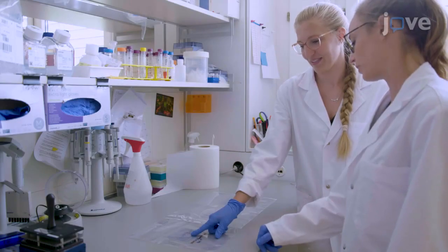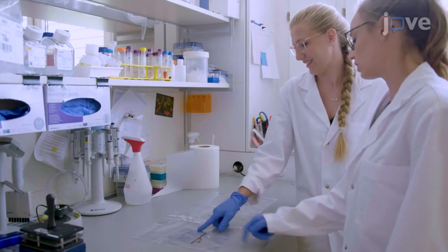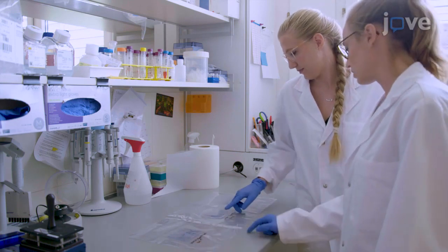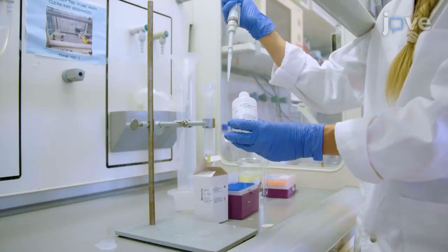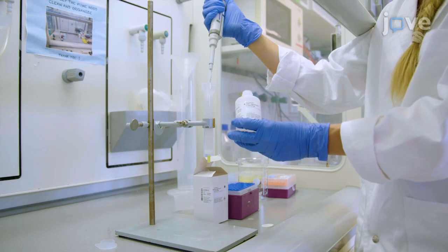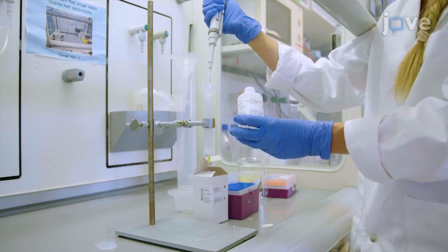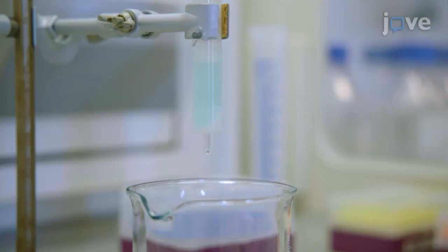Before you start, ensure that all strains overexpress their respective protein well. To begin, prepare the column for the one-pot protein purification as described in the text manuscript, using 2 mL of sepharose resin and then charge the column with nickel sulfate.